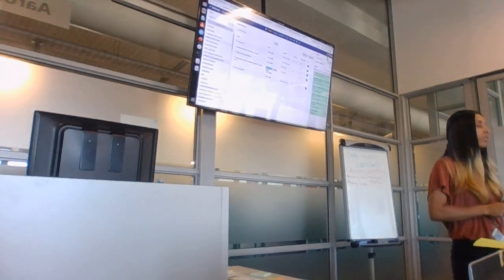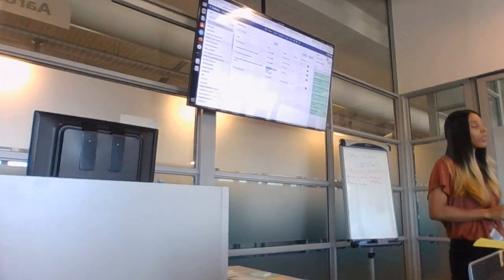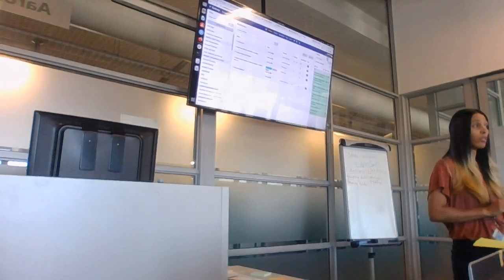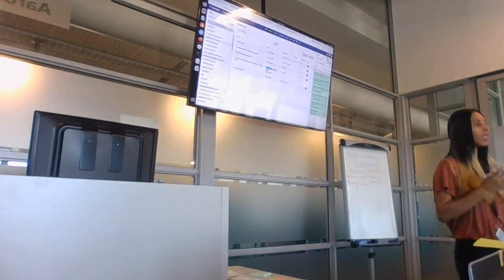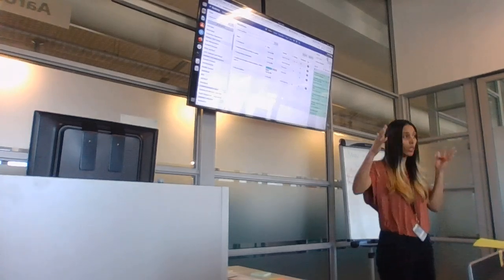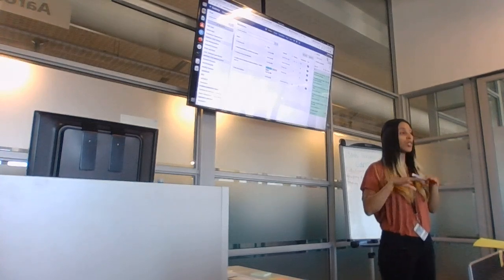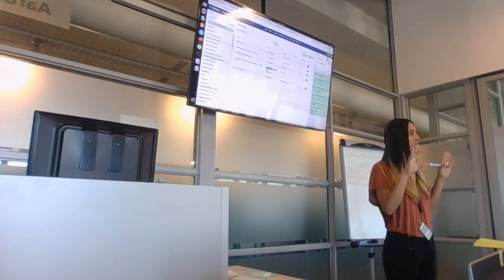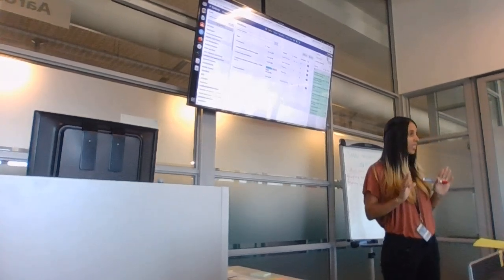Yeah, well, what do you mean by run? Because it's the same files. Are you asking about the FastP ones, the ones that you ran FastP on, that we processed? It doesn't matter. You can clean, because the cleaning doesn't get rid of contamination really. If it's a contaminated read, it will be throughout the thing. So cutting off the bad parts of the read and getting rid of duplication or all of that won't necessarily change it. It will be a clean contaminated read.